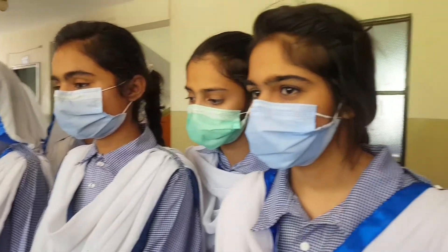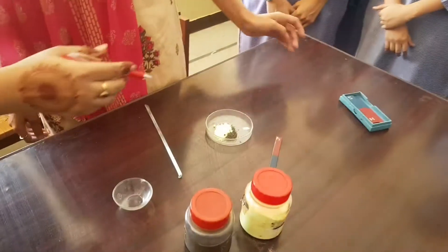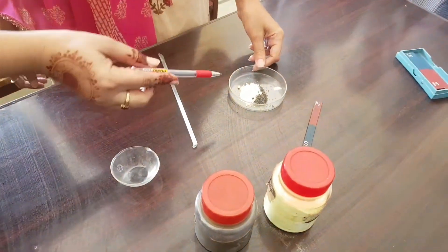The apparatus used for this experiment is a glass plate, paper, and magnet. The chemicals used for this experiment are iron fillings and sand or sulfur.